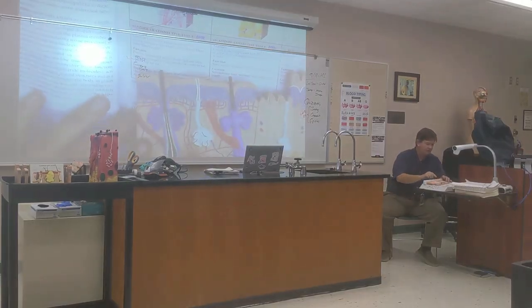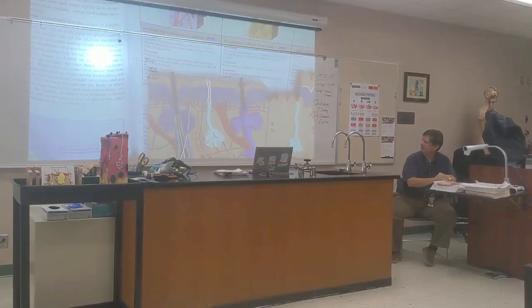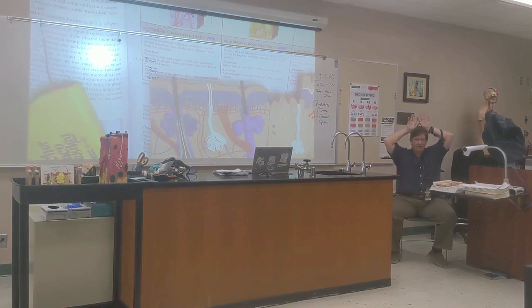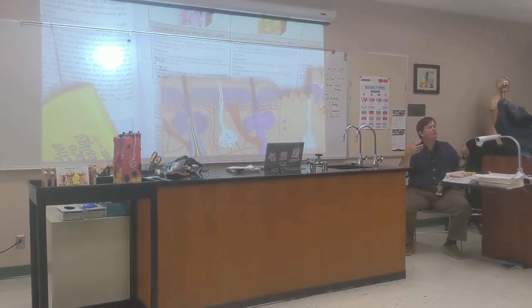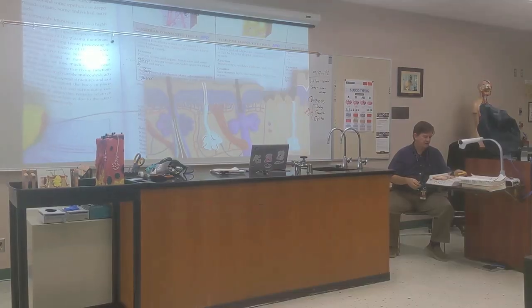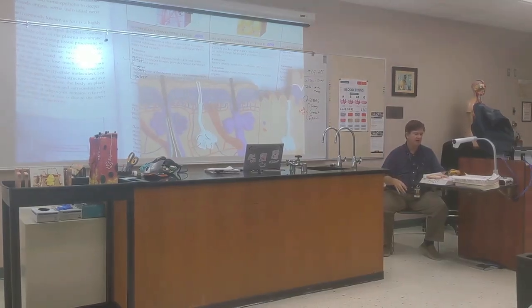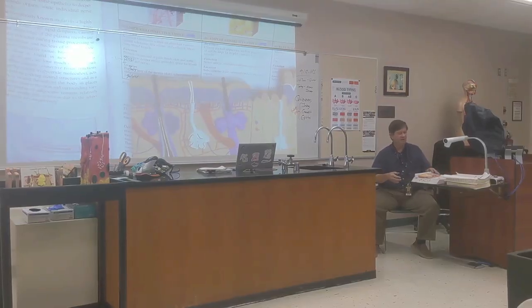But here, do you see, let me get a little pointer. Here we got a little sticky uppy part of the dermis, and another, and another. Those things that are sticking up, the anatomists who saw them thought they looked like fingers sticking up, so they called them dermal papilla. And the top part of the dermis is the papillary layer. Good? Anything below that is full of reticular fibers, and that's the reticular layer. Are we good? And that's like 80% of the skin.